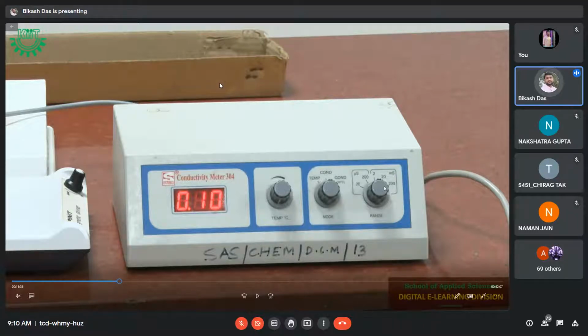May not be, na? Yes or no? Yes, sir. So in this, see, what is the technique? Just now I told you, we are going to calibrate the instrument by using KCl solution. So what was the KCl's conductance? 1.41. Yes, sir.